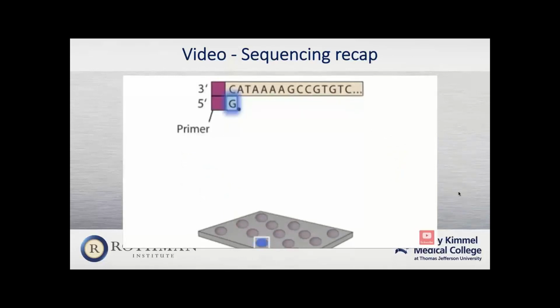A laser induces the nucleotide to fluoresce, and the color is recorded. Each spot on the solid surface has a particular fluorescence, depending on which nucleotide was incorporated into the growing strand. The fluorescent label and the blocking group are now removed from the nucleotide. Because the blocking group can be removed, this type of nucleotide is called a reversible chain-terminating nucleotide. The nucleotide now has the 3' hydroxyl group required for adding additional nucleotides.